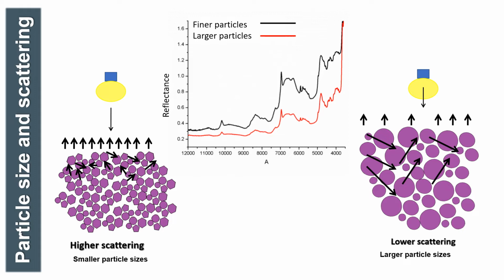If you look at the spectrum, you will see that there is a baseline shift, which is likely caused by the difference in scattering within the sample, with the smaller particle sizes resulting in a higher spectrum. This is an important point to keep in mind when selecting samples to use and when performing analysis. In some instances, it may be a goal to study differences in particle size, whilst in other instances, it may be of value to grind the samples to the same particle size to exclude this variation.